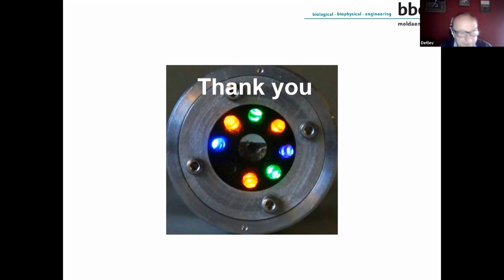All right, terrific. Next question: can one submerge the AlgaeTorch and get a profile from top to bottom in the water body? Well, as I tried to explain, the AlgaeTorch is not a real instrument for profiling. When I try to make a profile, I use a rope together with the AlgaeTorch. The AlgaeTorch does not have a depth rating. This type is only for a maximum depth of 10 meters because of the pressure resistance.